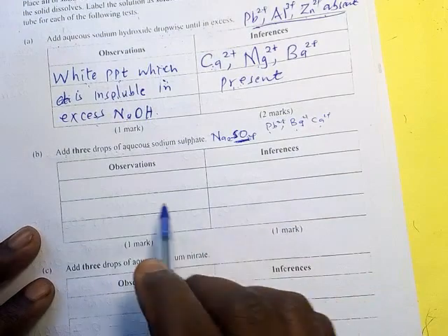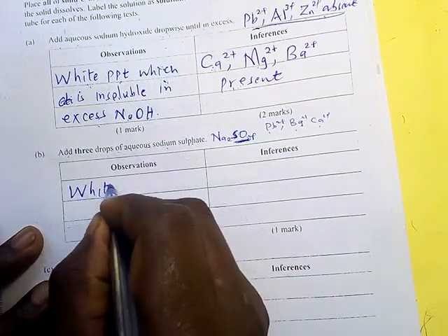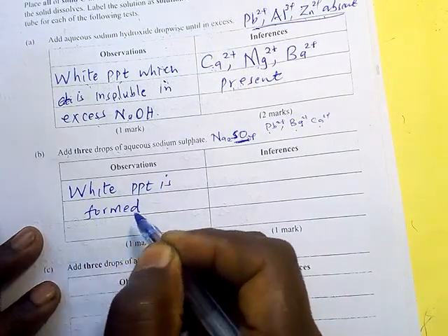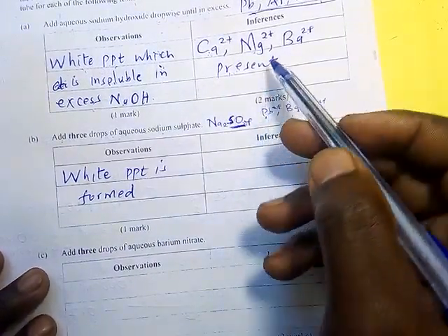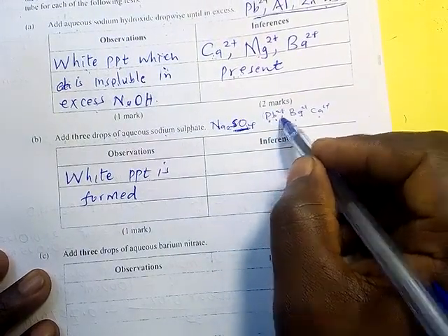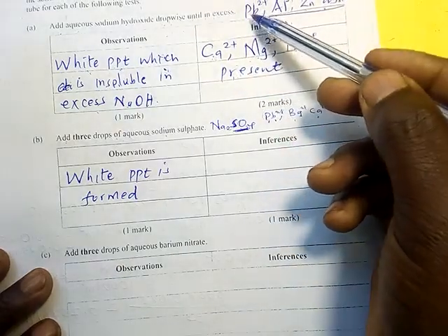So what was the observation for this one? White precipitate is formed. But if you put that lead is present, then you are contradicting yourself, because initially in our previous inference we said lead is not there.